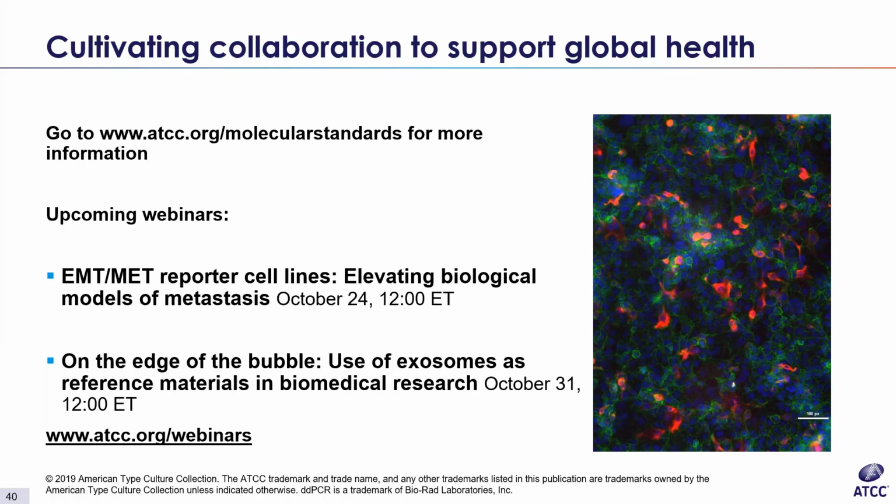Now, how are the genomic standards extracted? So the specific extraction method is something that we need to keep confidential, but in general, we use classical methods for fungi, bacteria, and protists, and we use a commercially available kit for viruses. Okay.